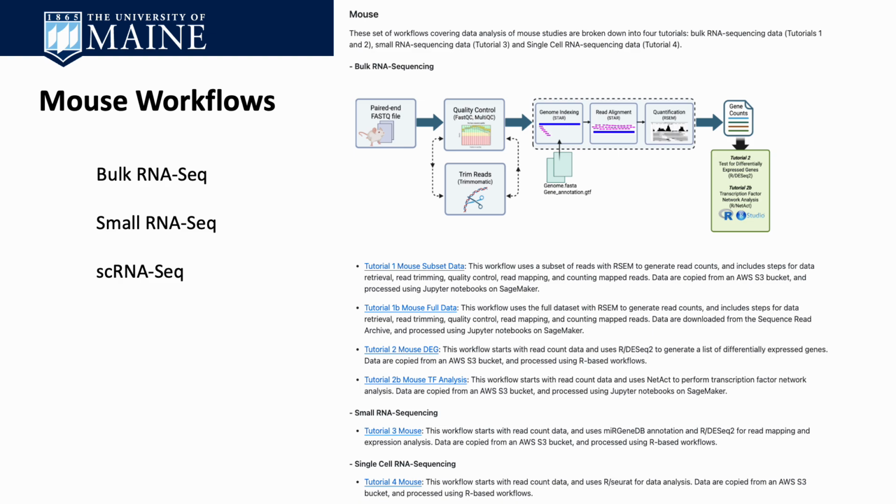For small RNA sequencing, there's just a single tutorial that covers all of the read processing as well as the differential expression analysis. And then finally, the tutorial 4 that's analyzing the single-cell RNA-seq.